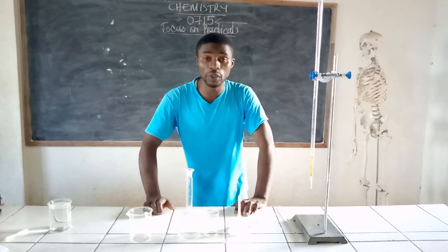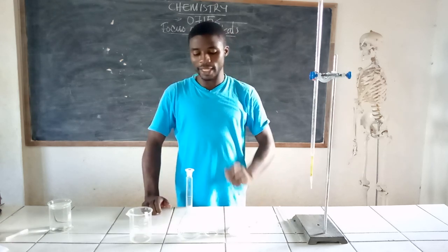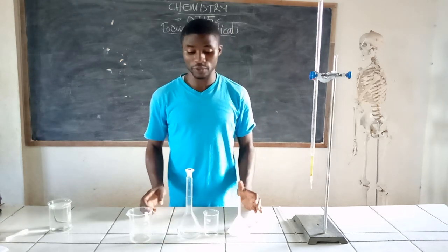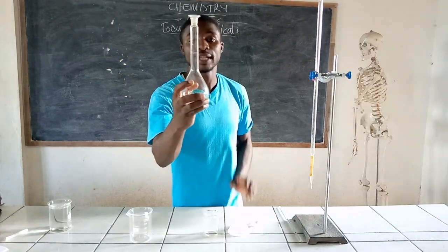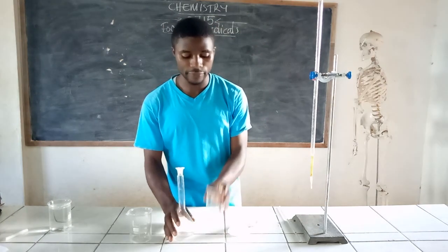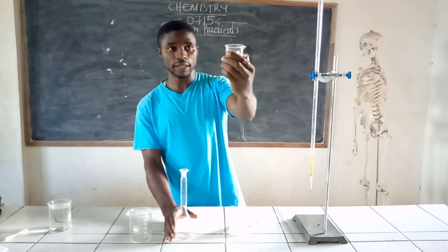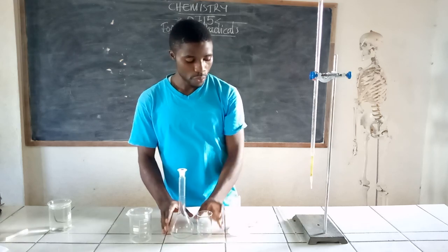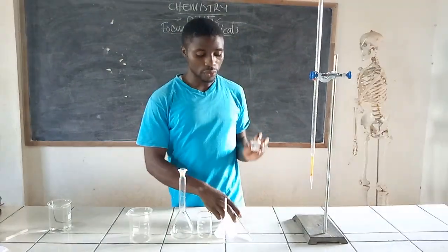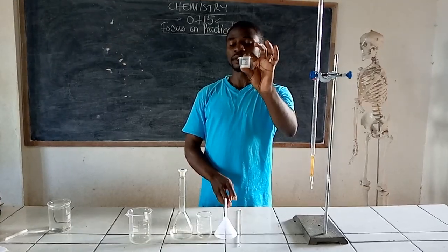First, you have to understand the equipment used in the preparation of a standard solution. Right in front of me you can see a volumetric flask — that's a 250cm³ volumetric flask. We have a beaker here, that's a 100ml beaker. We have a funnel and a stirrer. Also, we have our weighed mass.